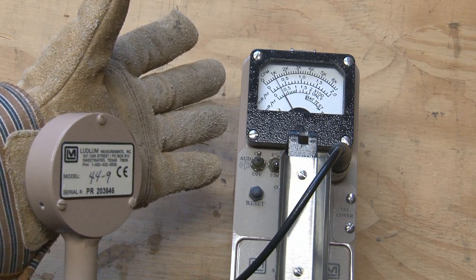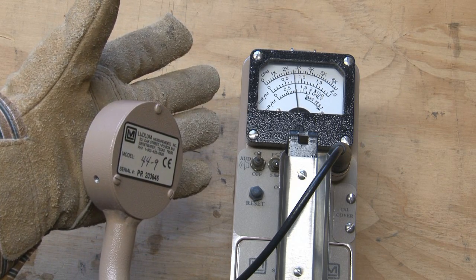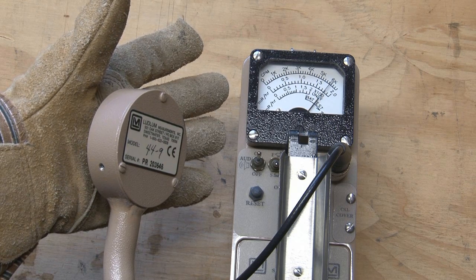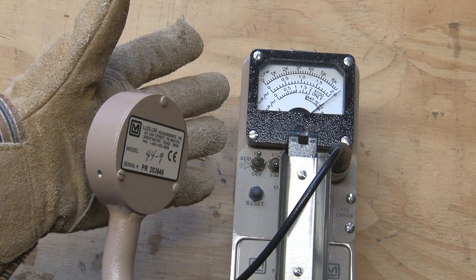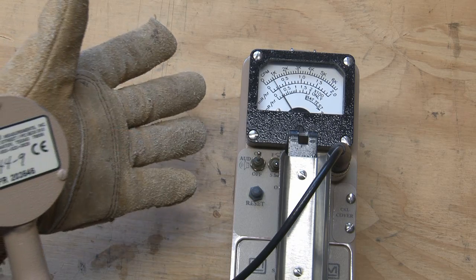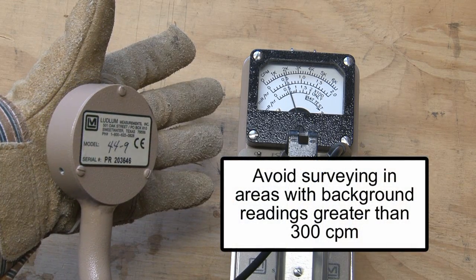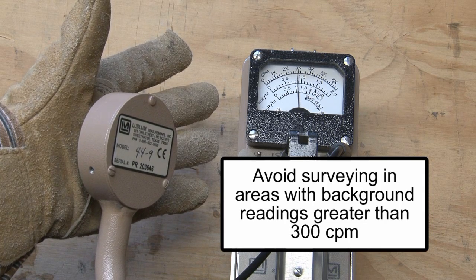With this type of detector, most jurisdictions consider an object or a person contaminated when you get a reading 100 counts per minute above background. Some folks will use twice background, but 100 CPM above background seems to be most widely used. With a limit like that, you shouldn't perform contamination surveys in areas where the background reading is greater than 300 counts per minute. You want to make sure you move an object or a person to a lower background area to survey.